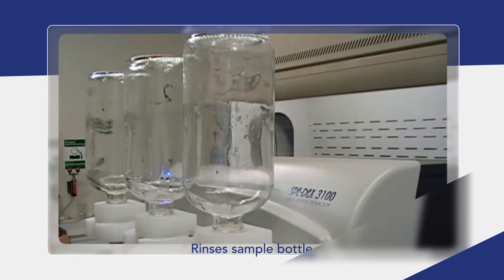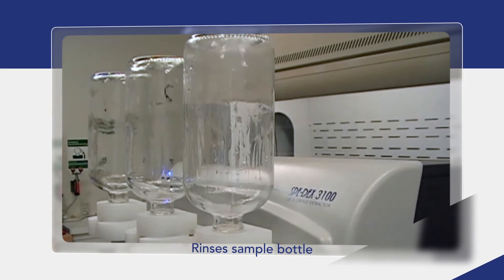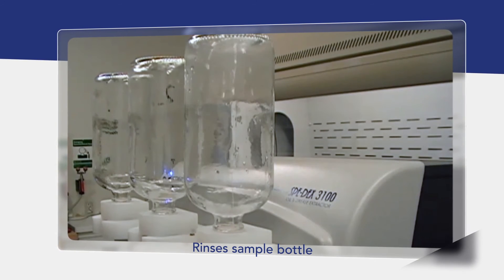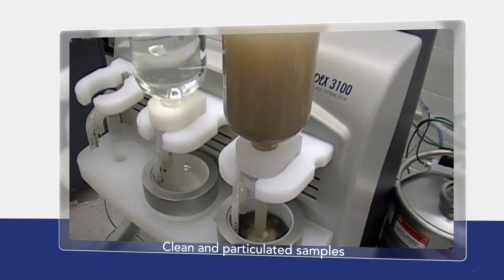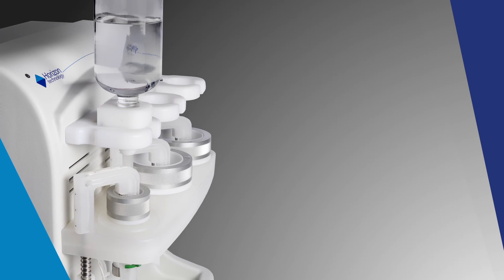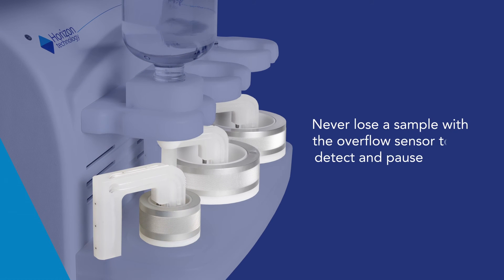The 3100 Extractor allows you to use the original sample bottle, then rinses it so if any material sticks to the interior of the glass bottle, it is included in the extraction. It handles the full range of complex samples that may be encountered, from relatively clean water to lots of particulates. The system offers better matrix handling for complex samples with larger solid phase extraction discs and pre-filters, so flow through the SPE disc is never compromised.